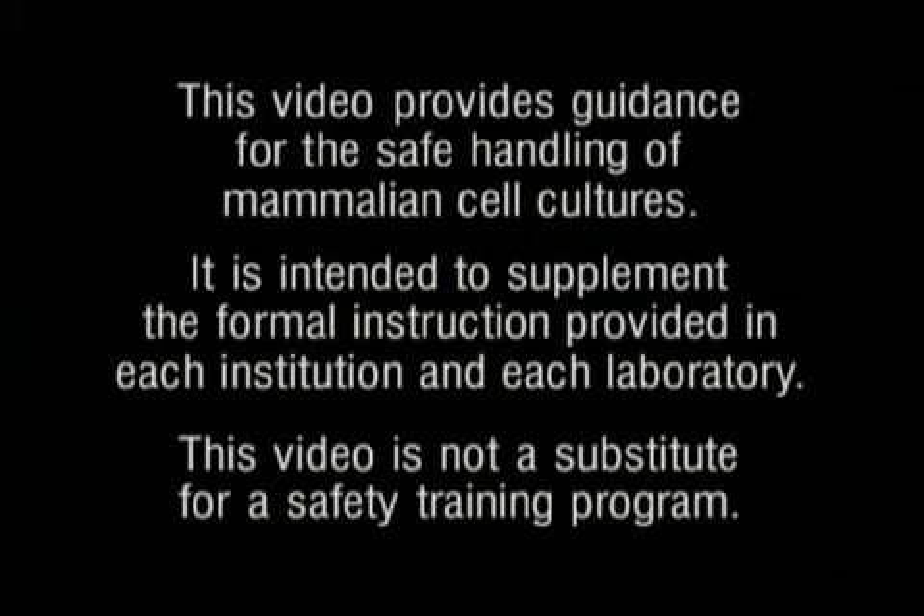This video provides guidance for the safe handling of mammalian cell cultures. It is intended to supplement the formal instruction provided in each institution and each laboratory. This video is not a substitute for a safety training program.